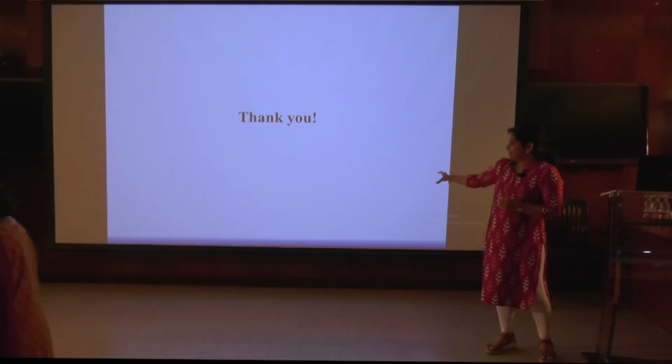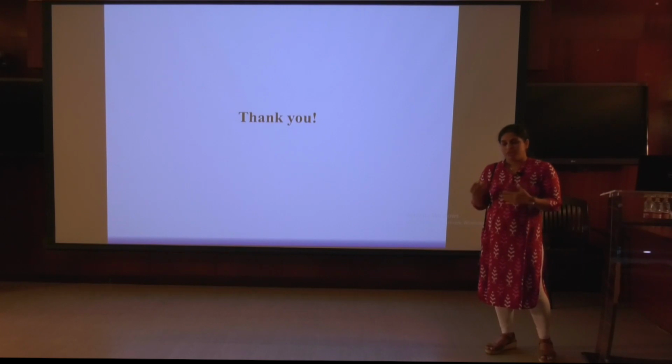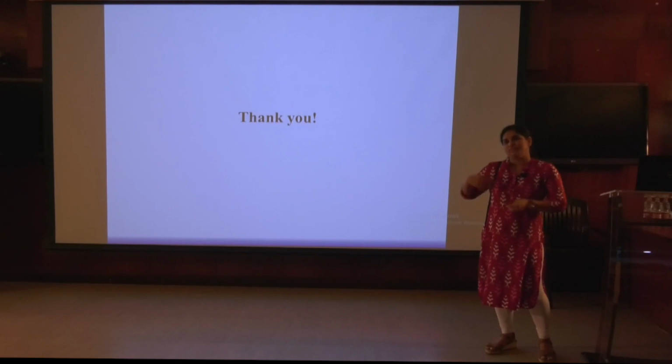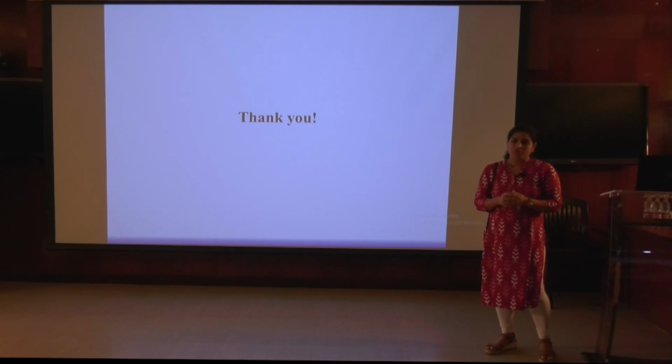In those cases, we also utilize what I mentioned very briefly at the end, a method called correlative light and electron microscopy, where in most cases they tag the smaller proteins, so you know where the proteins of interest are on the cell, and then you focus on those areas for your tomography data collection. In those cases, yes, you can tell the difference, but what is more important in microscopy, because everything can be seen, is that you need to be able to identify your protein of interest.